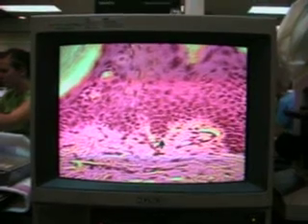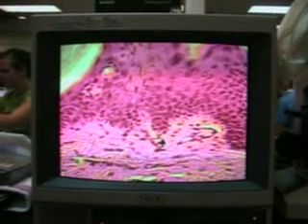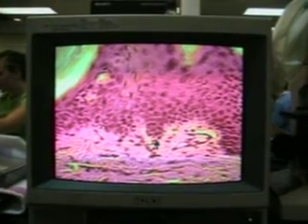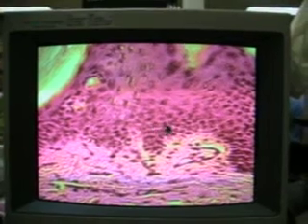Okay. So this probably is the best example of columnar basal cells, but you can really see a demarcation between the dermis and the epidermis here, and the first cell that interfaces that is the basal cell. And then you can appreciate now these are polygonal cells, these are stratum spinosum cells, and they are interdigitating with each other. And this is either a tangential slice, so you can see here the nuclei that are quite prominent for some of these. But the cells undergo some apoptosis too, so occasionally you'll see some apoptotic cells.